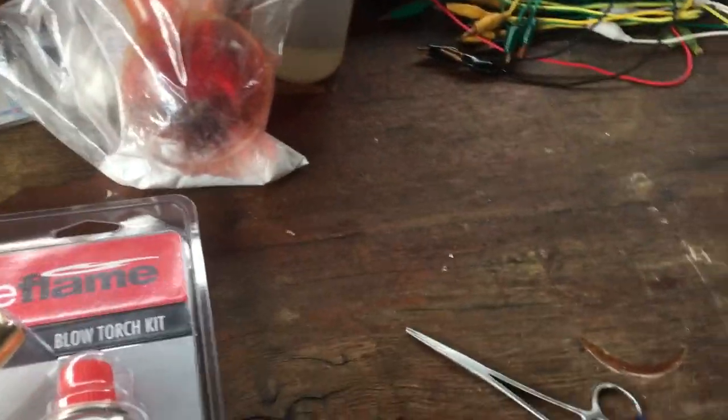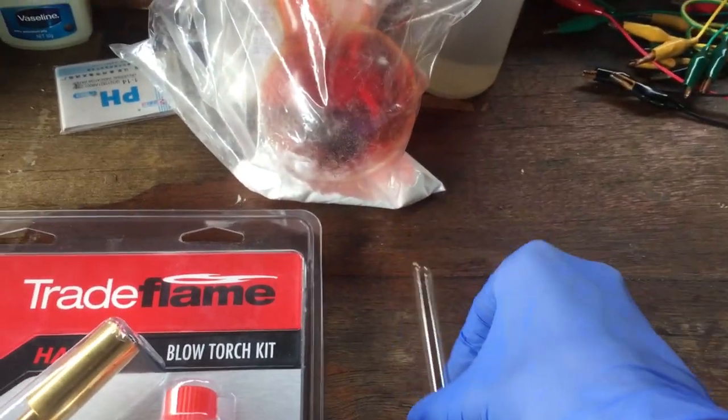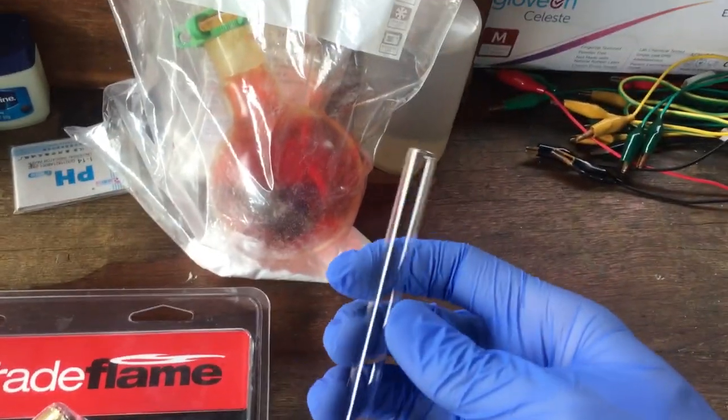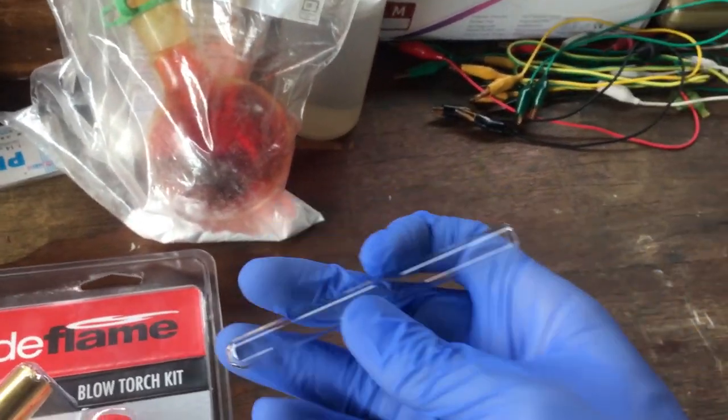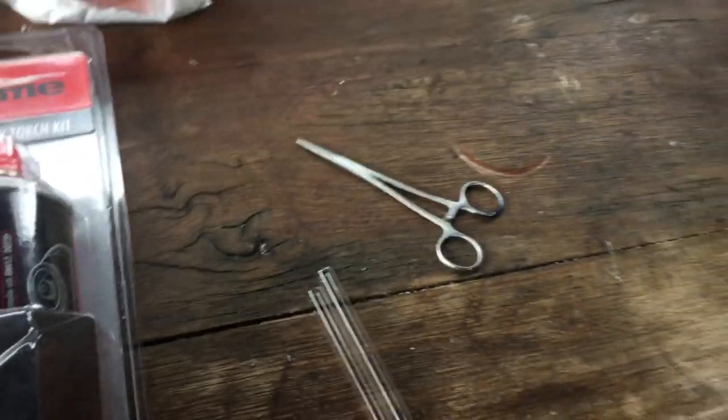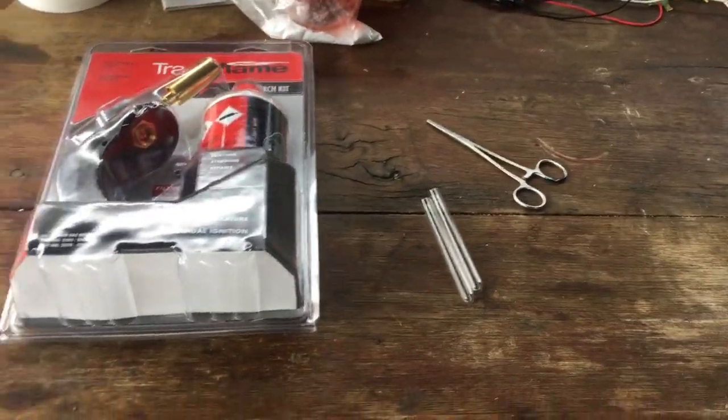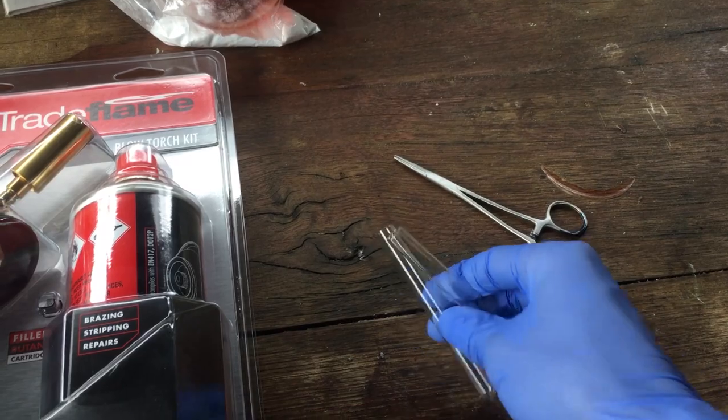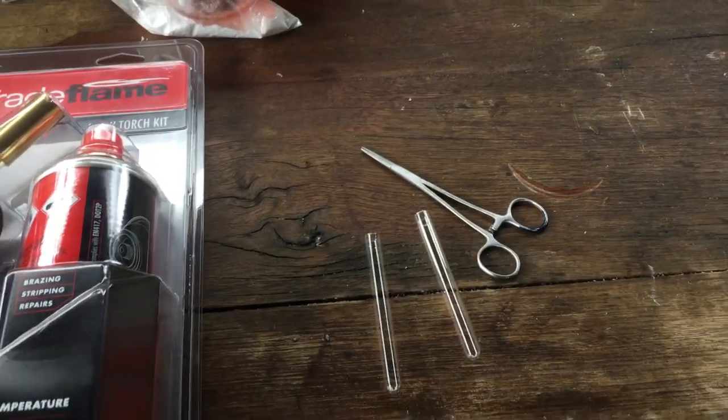But anyway, what we're going to do today is try to seal that bromine in ampoules that we're going to make from test tubes. So hopefully this will be a short video where you just get to watch me make ampoules really badly.